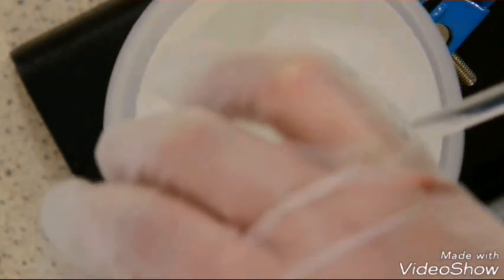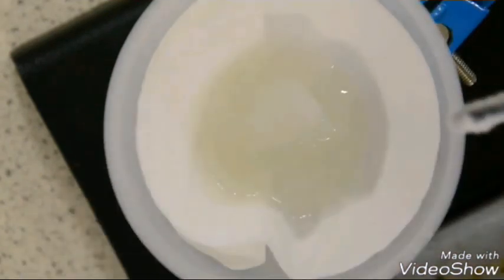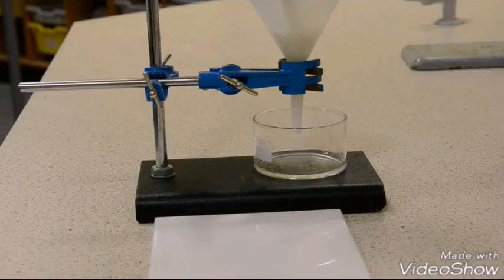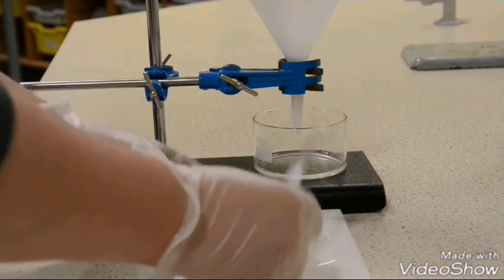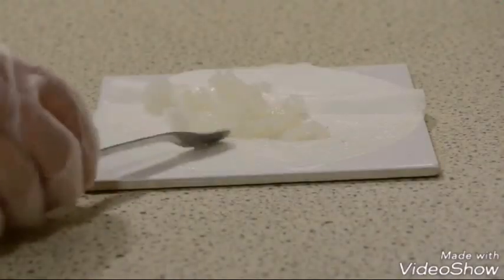The last thing we need to do is filter off the soap that we've precipitated out using the sodium chloride. So I've just set up a standard filter funnel filter paper arrangement. I'm going to scrape the mixture into it and wait until the filtrate has finished dripping through. And here's the final product.